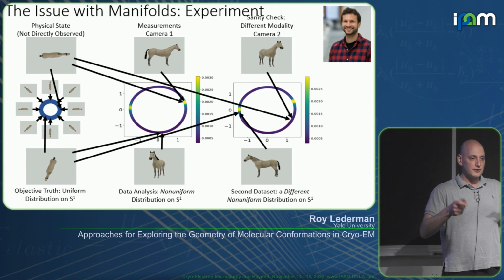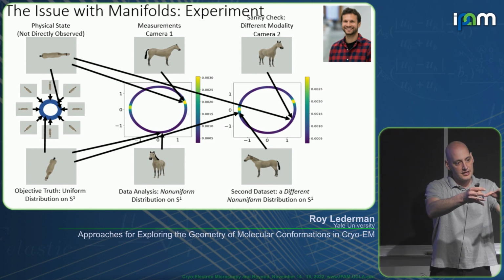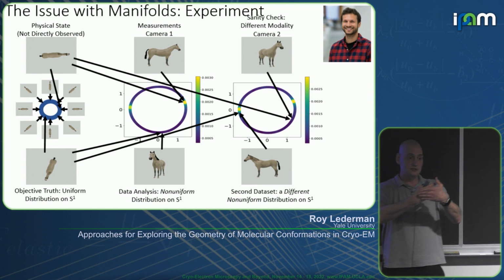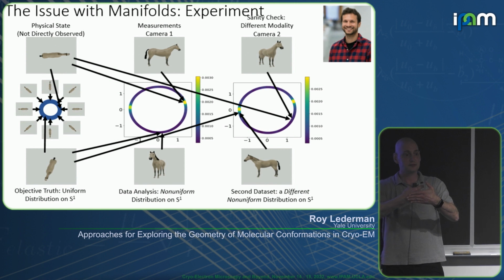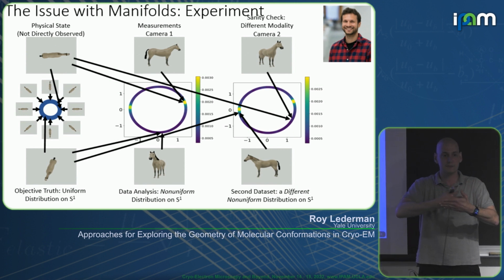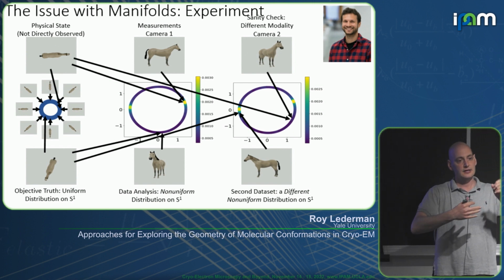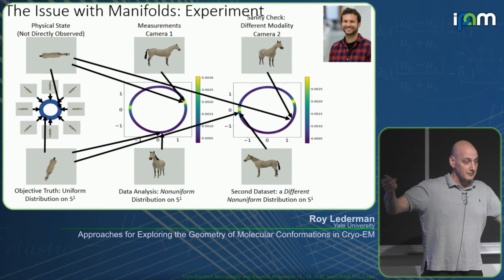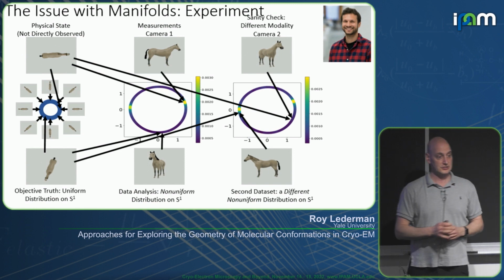And basically the reason behind it is the metric. The metric in this experiment, the metric of the images of the horse, actually depends on the viewing direction. It doesn't directly reflect the physical angle that we would hope it reflects. So exactly to your question, okay?